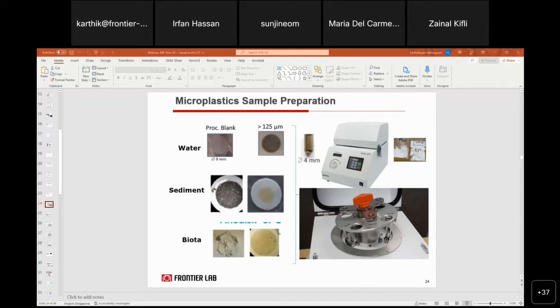So why do we need this? What we found when we did our standard analysis without the pre-column, we found the polyethylene pyrolysis C8 hydrocarbon and the nylon 66 cyclopentanone are being co-eluted. With the pre-column, we were able to separate this. So it's really helping a lot. Otherwise, you may have to do the extracted ion chromatogram separately, which is not something everyone prefers. So the small addition of a guard column improves the separation of some of the polymers' pyrolysis products.